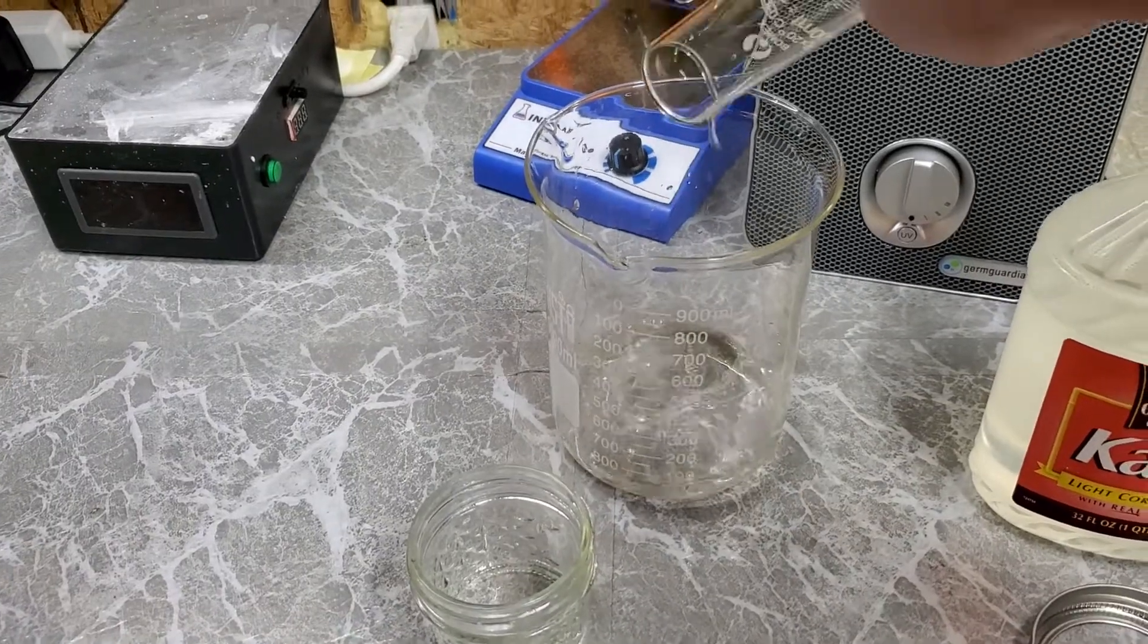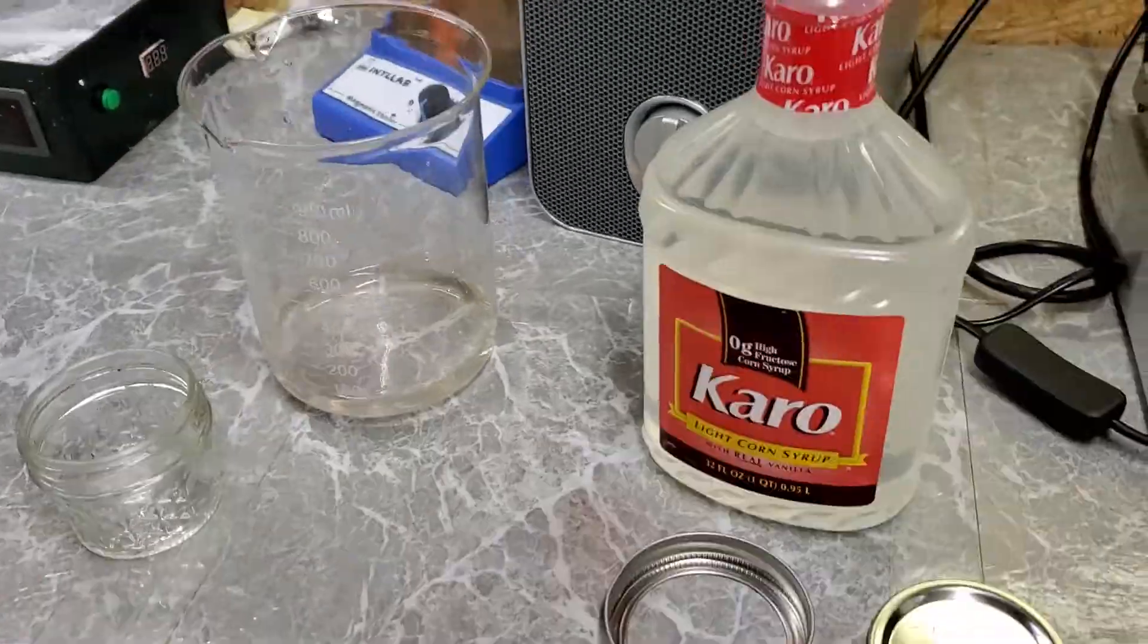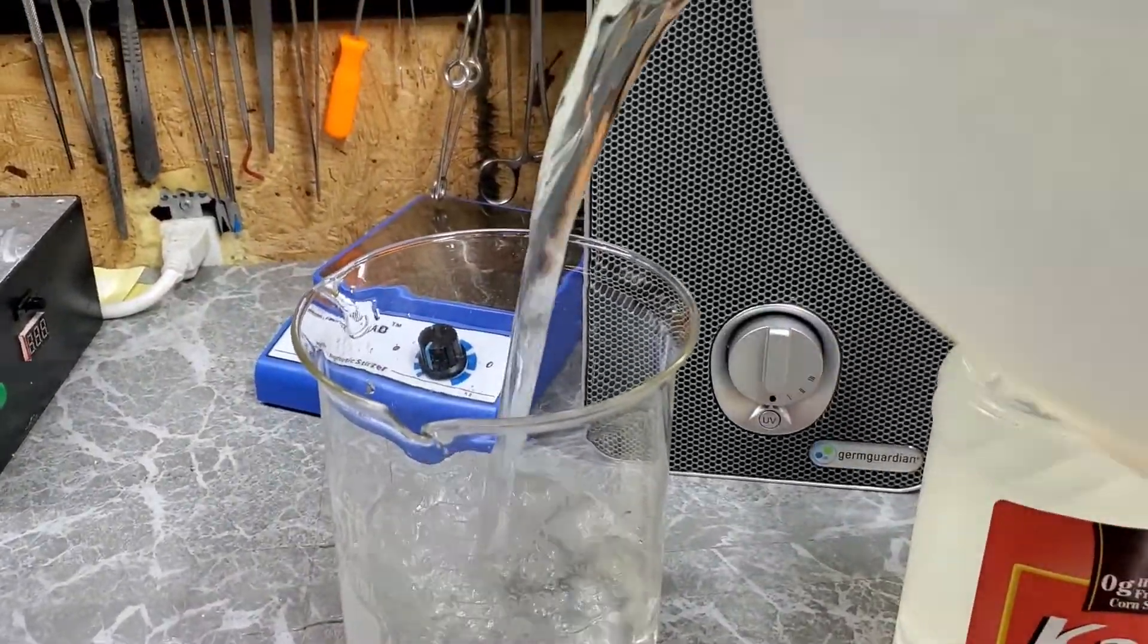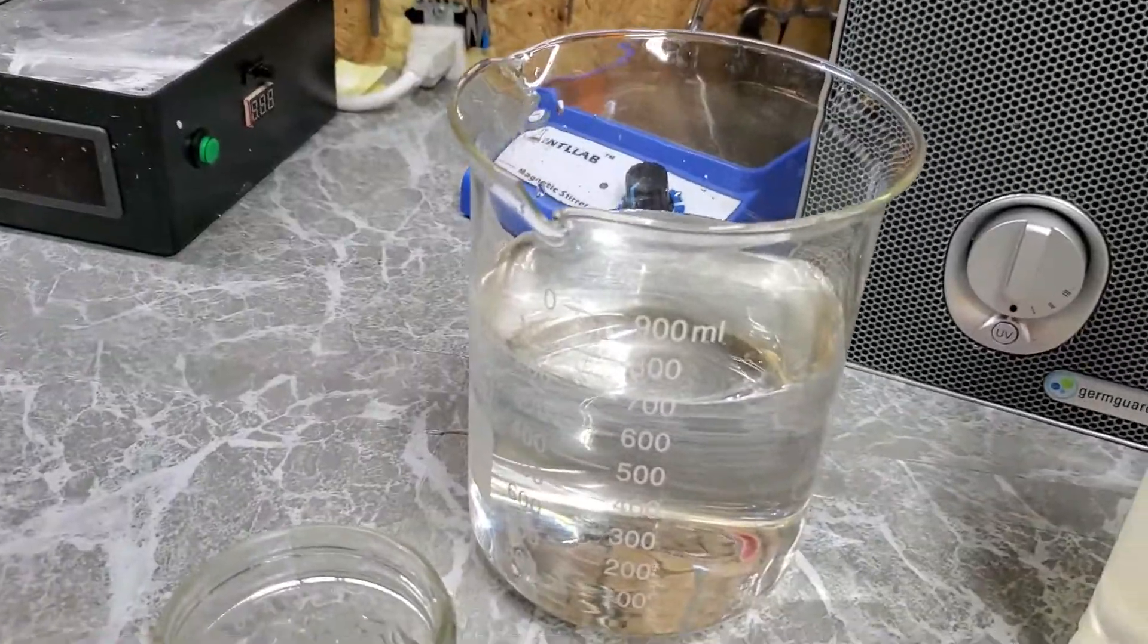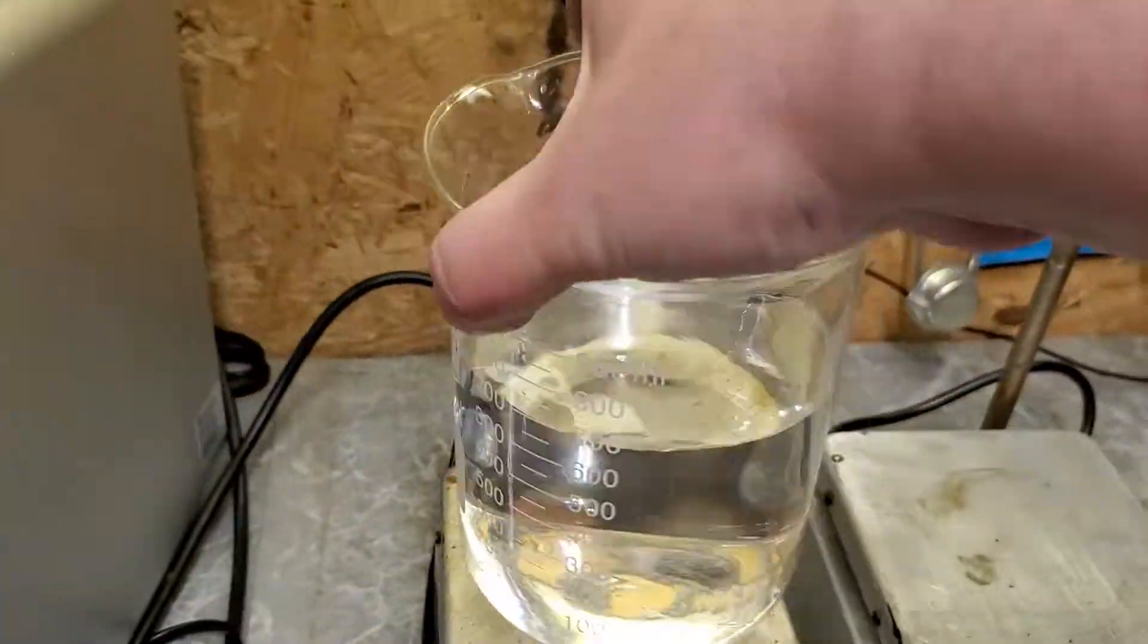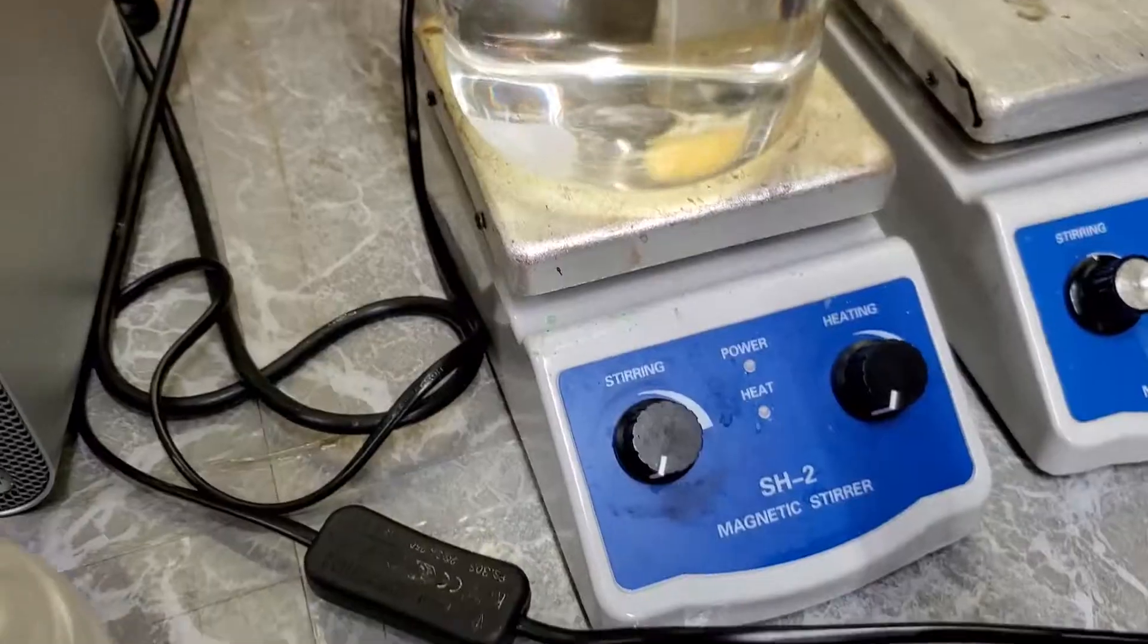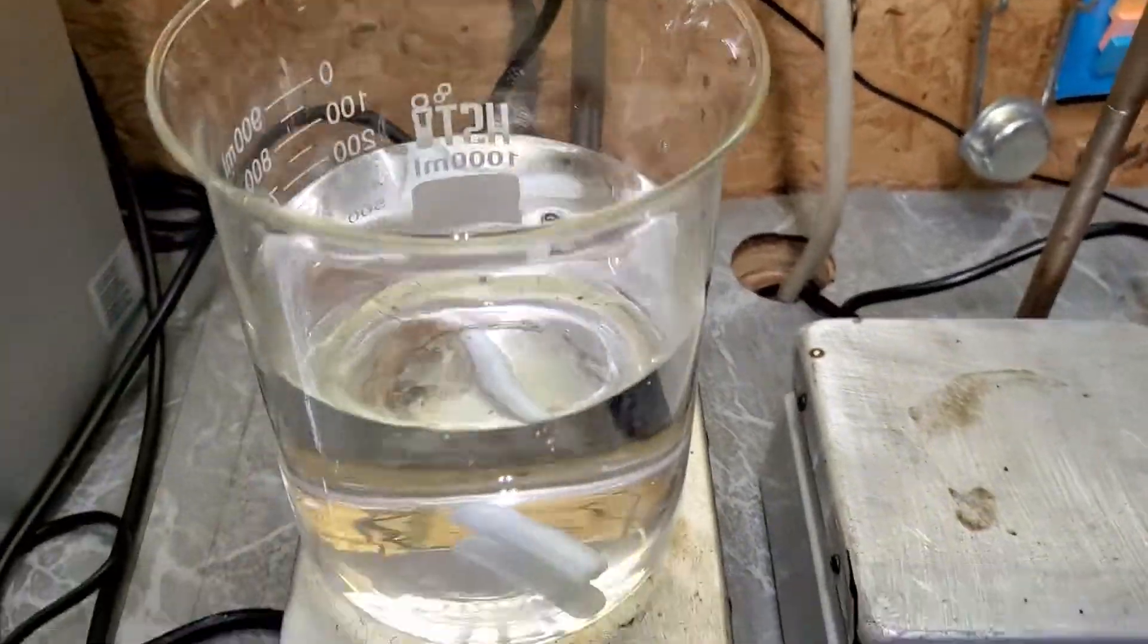Let me pour that in this beaker and get my jug of distilled water here. It may have went a little over, but that's fine. We'll go with 700 milliliters. Since we have the distilled water in our beaker, let me get a nice size stir bar here. Let me place this on the bottom there.